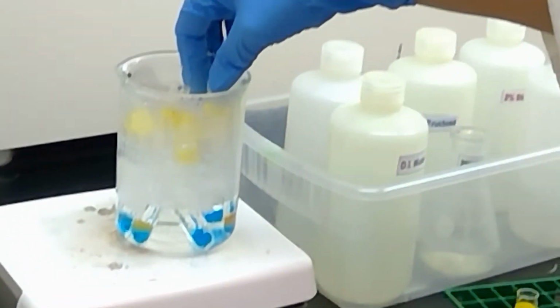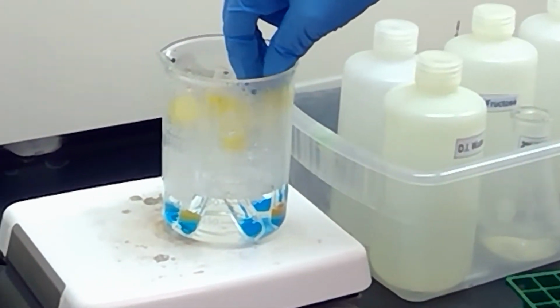Let me pull out the other one that is turning reddish here. And it's our other monomer, glucose.